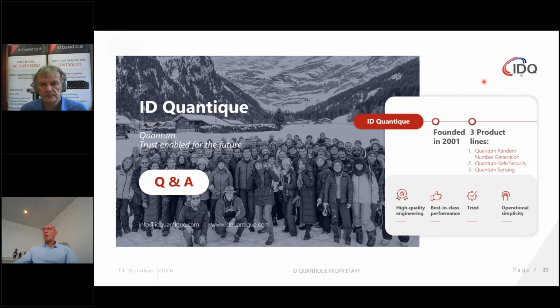You showed an example with mice. Is it a technique that is used for human beings? No, it's not yet used for human beings, because we're not allowed to inject quantum dots in people yet, because of the hesitation of using materials that are very small, nanomaterials, in humans. We don't want to have a repeat of the asbestos scare.